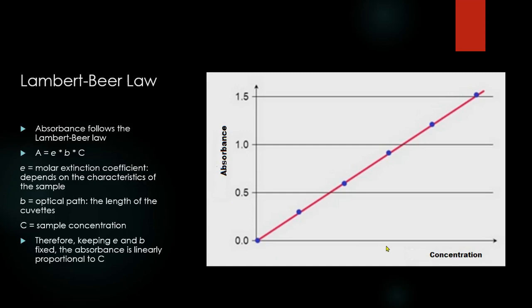And this is what we do with the Lambert-Beer law. What we do in the measure with a spectrophotometer, we measure the absorbance of a sample. The absorbance is related to a concentration. So by measuring the absorbance, we calculate the concentration of a sample. The concentration means, for example, the concentration of iron or nitrate or nitrogen ammonia, and so on. It depends on how the sample reacts.